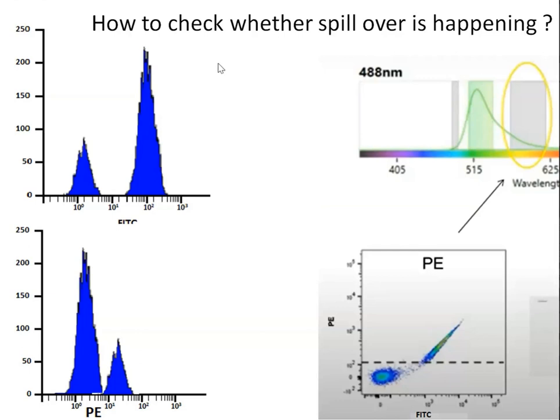Now I will take a sample and stain only with FITC. I may be using a 10 color instrument. I take a sample and label it only with the FITC fluorochrome. Then I run the sample in the flow cytometer and check the FITC channel. In the FITC channel there is a signal. Correct? There is a signal.